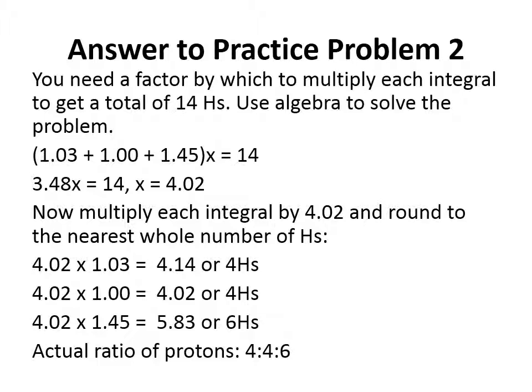Now you really can't have 4 hydrogens in one spot or 6 hydrogens in one spot, so there must be symmetry in this molecule. There must be 2 identical CH2s making 4 hydrogens in one area of the molecule, another set of 2 CH2s making 4 hydrogens in a different area of the molecule, and 2 CH3s making 6 protons in another region of the molecule.